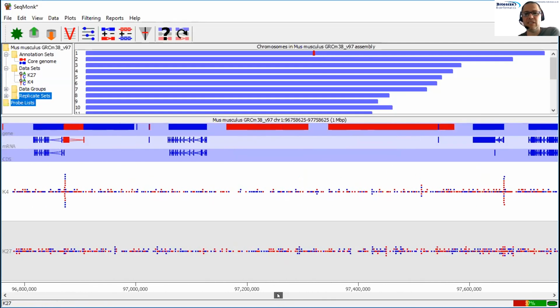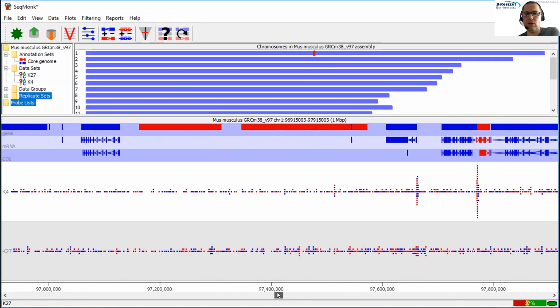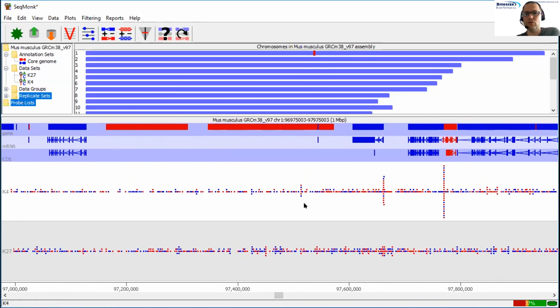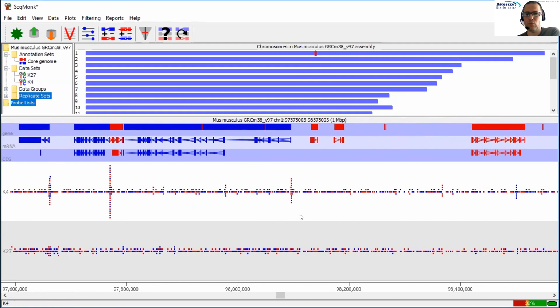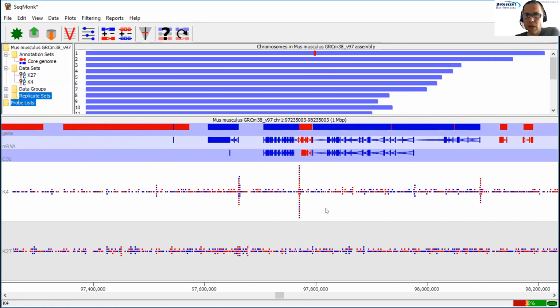That can be a little skittish because you're looking at quite a large portion of stuff, so you can use the scroll wheel on your mouse to move a little more easily in smaller chunks. You can zoom in by just dragging a box.